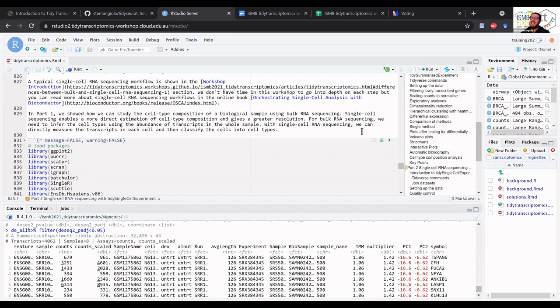And again, SingleCellExperiment is an object from Bioconductor, a very popular container, and tidySeurat. And Seurat is a workflow, but also an object, a data container, also very popular. And so we have created these interfaces for these two objects. There will be a difference though.